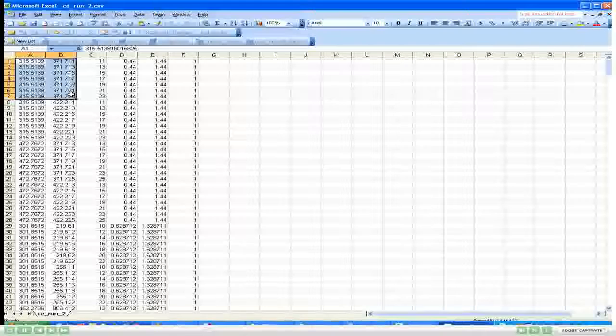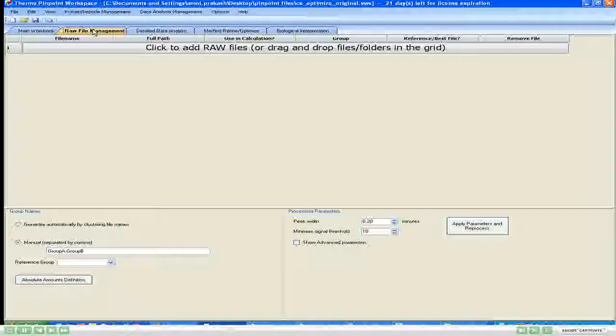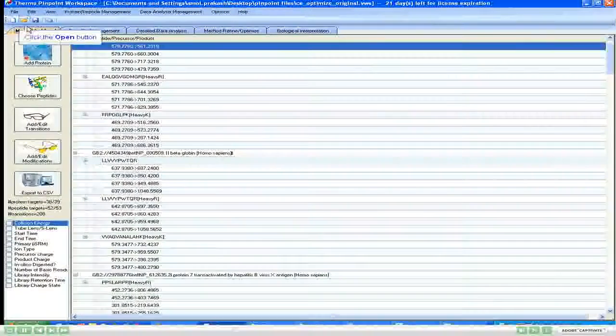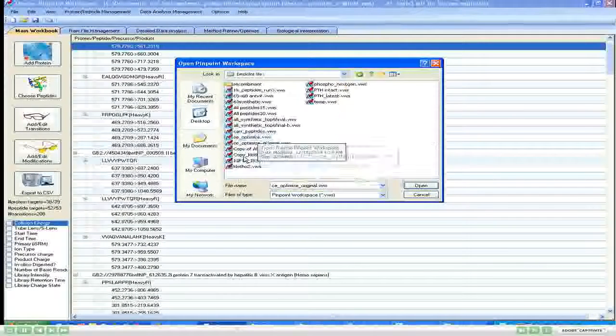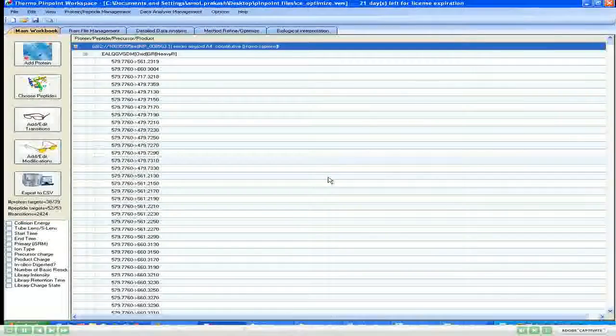So it will go minus 6, which is 16, and then plus 6, which is 28, and do 16, 18, 20, 22, 24, 26, and 28. All these 7 possibilities for every single transition. And so we'll do it for each of those 208 transitions that we are monitoring on this window. And so our scheduling will obviously become worse.